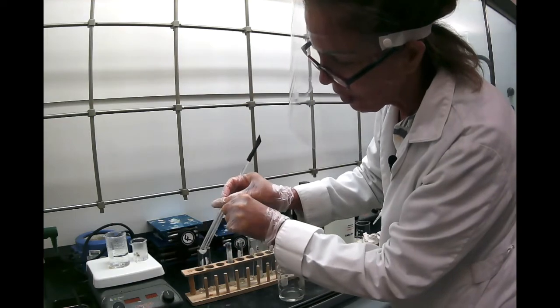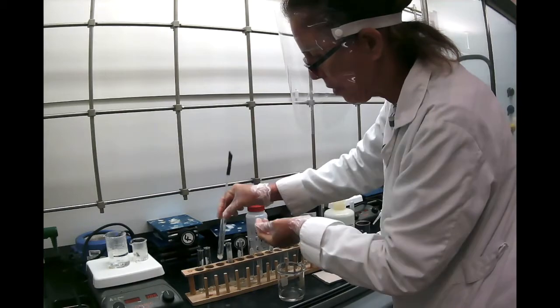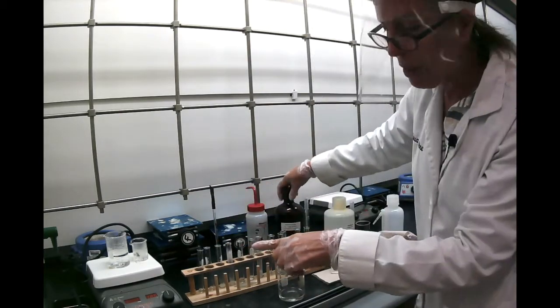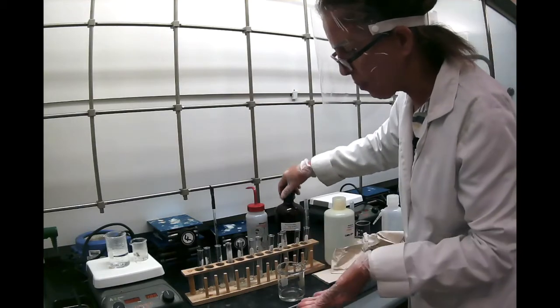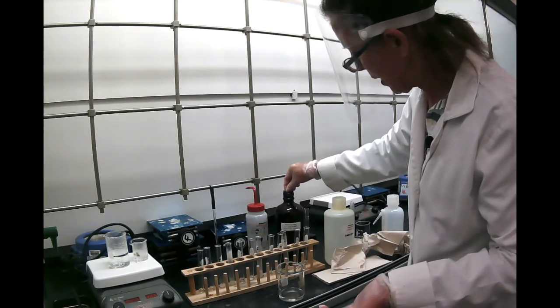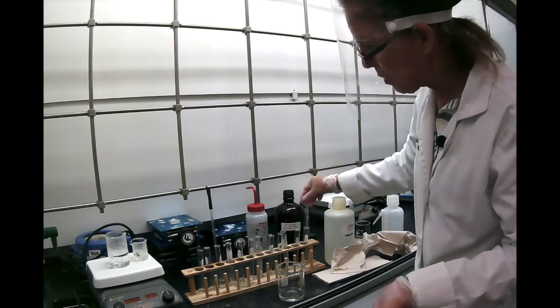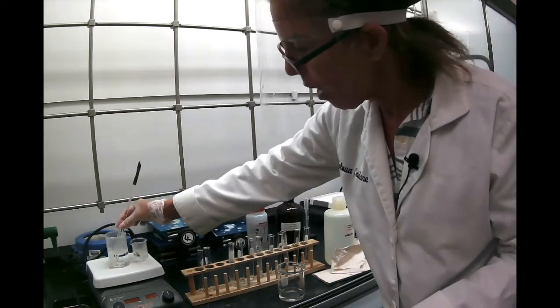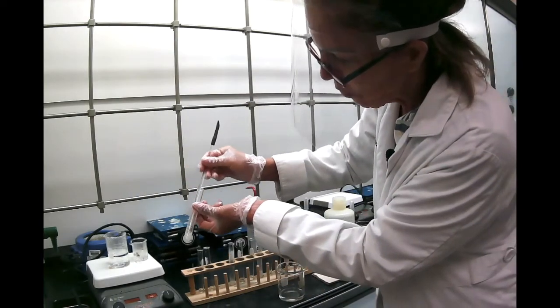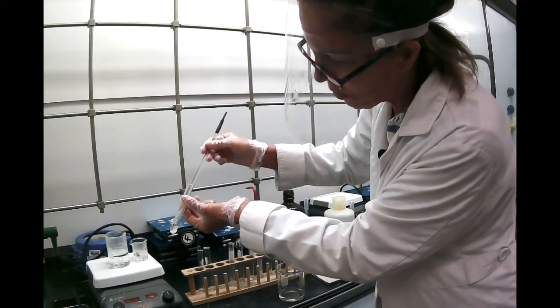So I'm going to add more petroleum ether, but the reason that resorcinol dissolved in water is definitely because it's polar. Petroleum ether is not polar, so we don't expect it to dissolve. See, it's already boiling over, and it's not dissolved in petroleum ether.